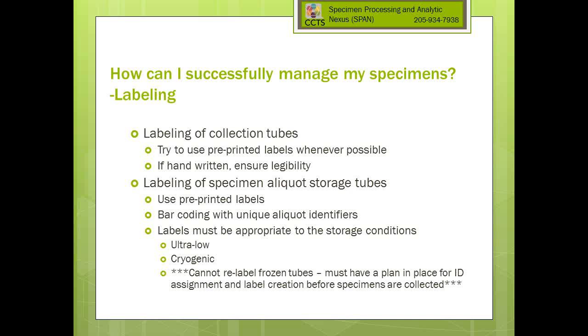The issue with pre-printed labels here again is if you use a label that's appropriate for storage conditions, they can be pre-printed in such a way that the ink does not come off. In fact, we use one label where it actually has a clear half where it wraps around and the clear part covers the printed side, so it actually can never be rubbed off as it goes in and out of the box, and is protected, so you can always read what's on it.